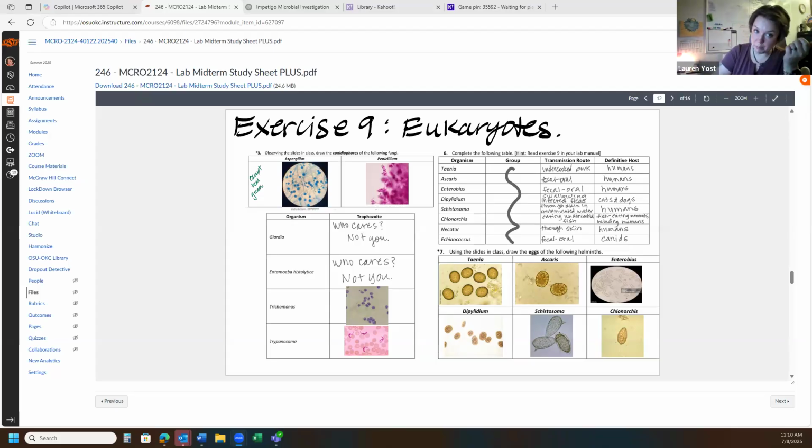But yeah, if your microscope is set up at 10x and it looks like this, you can clearly see the pink grape-like structures. Y'all, that ain't a bacteria. It's unlikely it's even a protozoa, because even these guys, I usually had to go at least 40x to get these images. So probably a helminth, and we only looked at the eggs for the helminths.